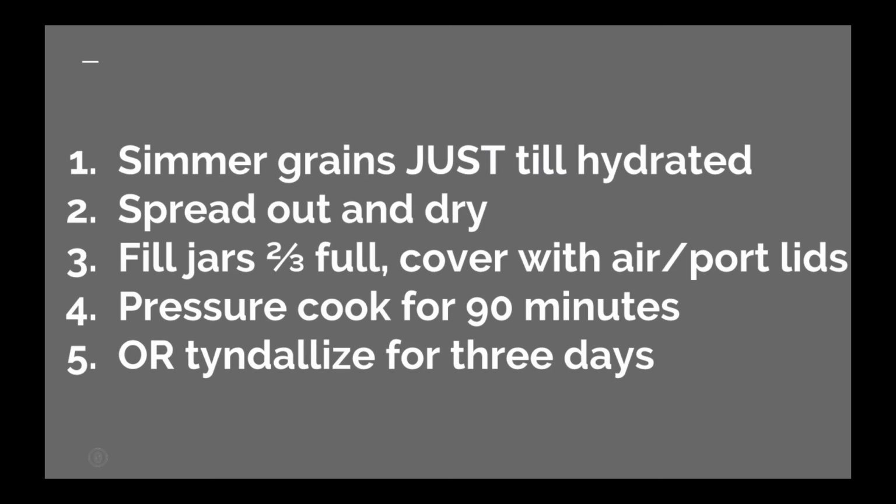Any remaining spores are very likely to sprout during the next 24-hour period and similarly get killed. And once you've done this for 3 days, you wind up with a jar that is essentially completely sterile, except in very, very rare cases. But either way, you need to either pressure cook your jars for 90 minutes or tyndalize with three steamings.